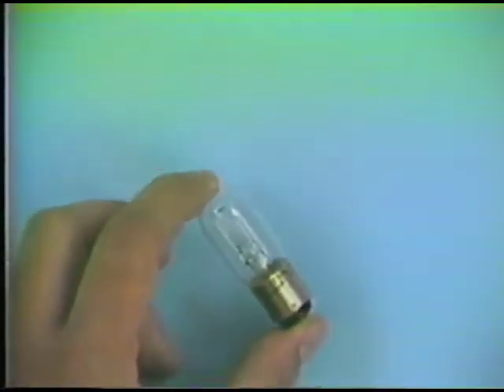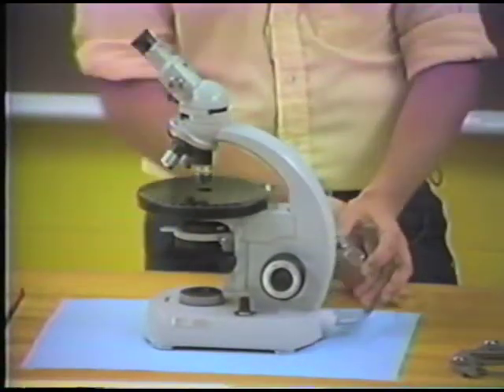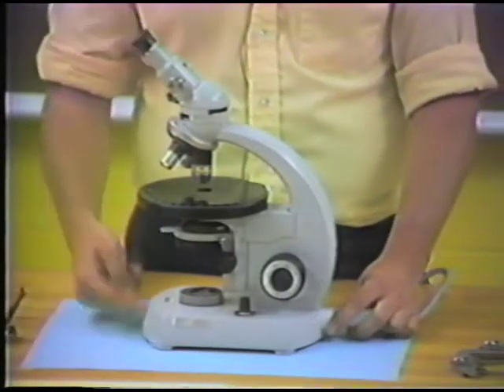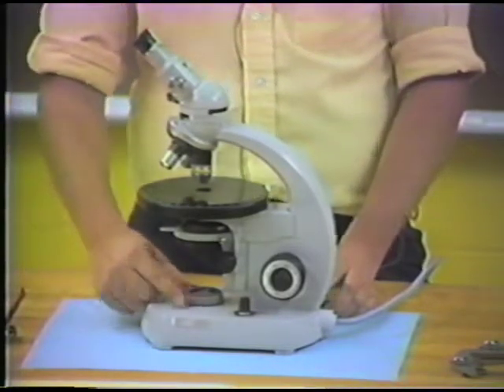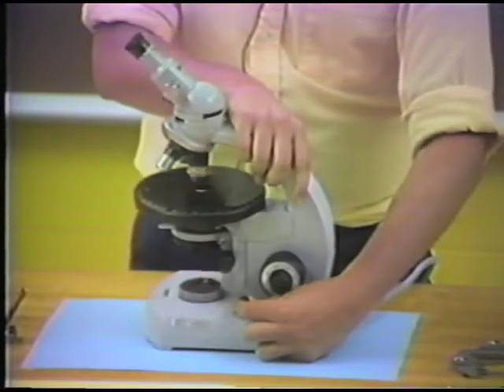And the bulb is placed actually inside the microscope. And you can see the cord emerging from the microscope in this position. And the bulb is located here, just below this opening. And there's a switch on the side of the microscope to regulate and turn the light on.